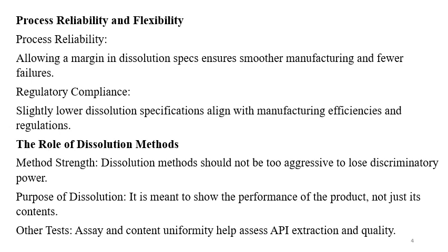So always dissolution testing should be performed with milder conditions or standard dissolution conditions. I have made many videos on these topics, so you can go through the playlist and watch those videos. So here I have just mentioned that the dissolution method should not be too aggressive, or the parameters should not be such that it loses discriminatory power.